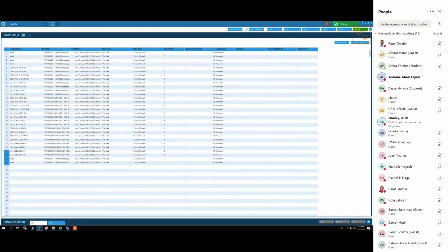Okay, and one quick last question. Supposedly I want to do some specific proteomics analysis, and I want to switch the solvents to acetonitrile with formic acid and water with formic acid, but adding 1% DMSO to them. Would you also run blanks prior to your sample several times, or just leave the LC at a specific flow rate?